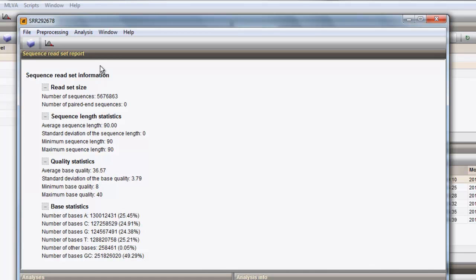From the SRS report, some basic summary statistics on the reads are displayed, including information on read set size, sequence length statistics, quality statistics, and individual base statistics.